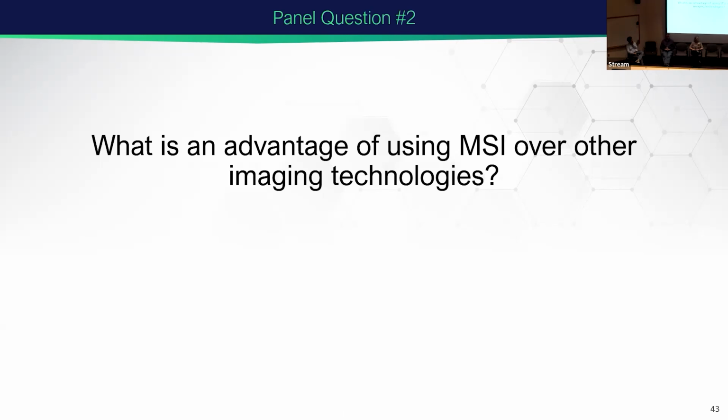So when we're talking about mass spec imaging, especially Fourier transform mass spectrometry, where we're indirectly detecting all of these samples, just because you have an m/z 100 at an intensity of 1 and an m/z 200 at an intensity of 1 doesn't mean that these are equivalent. So when we think about quantitative mass spectrometry imaging, there are a lot of unique aspects we have to take into account.